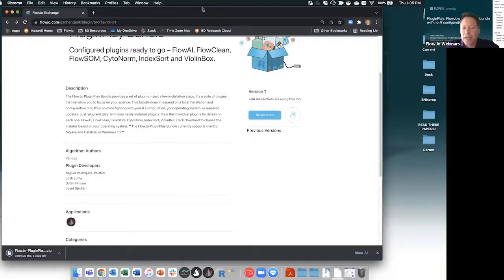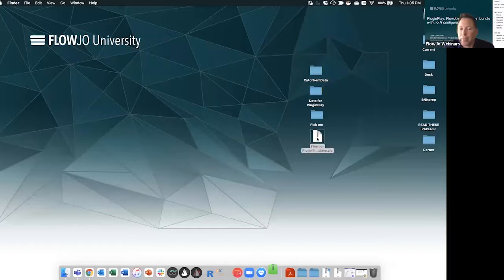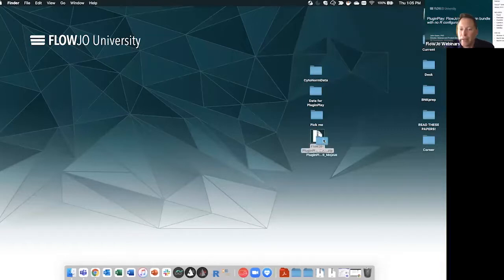And let's just peek in at the Q&A. I see there is a question. Can the R installed be used otherwise, e.g. for non-bundled plugins? Yes, but you would have to point to it, so there would be a moment of setup, Malcolm. All right, and I will leave Q&A up in case anybody else has other questions, and just see if I can minimize it.